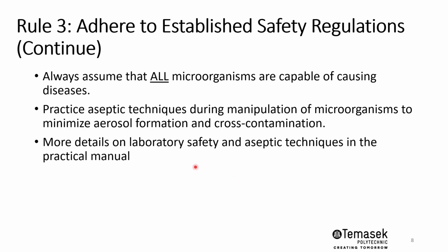Always assume that all microorganisms are capable of causing diseases. Don't take your guard down. You never know. In the case of microorganisms, they may be harmless, but if they manage to get into your body, remember from topic 1, they may become opportunistic pathogens.